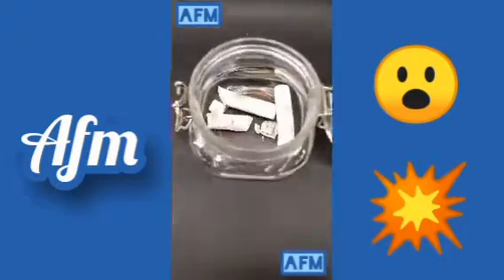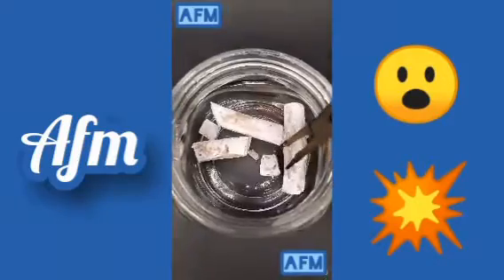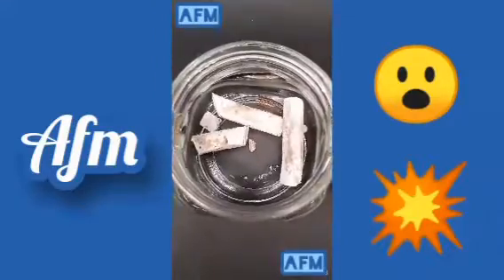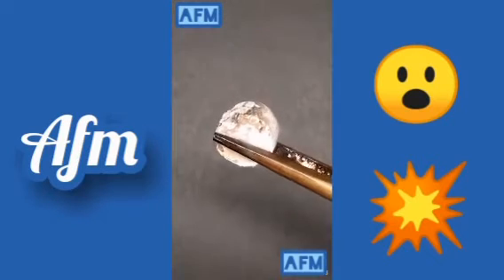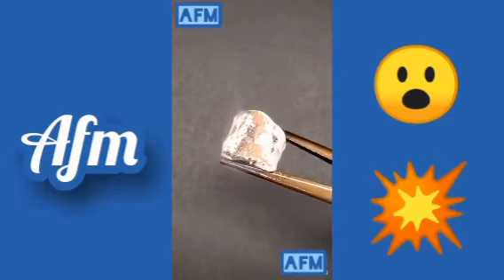Phosphorus is an element that can come in a few different forms. One of the most reactive forms is white phosphorus, and a while ago, I was able to get some chunks of it. It's stored underwater to protect it from air, and the moment I take it out, it starts smoking. This is because it's reacting with oxygen and letting off phosphorus oxides.